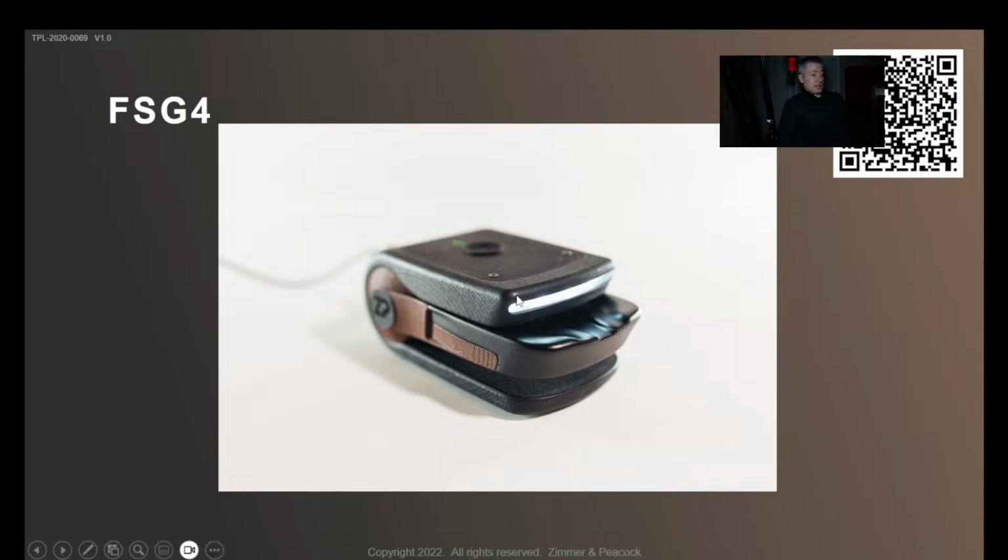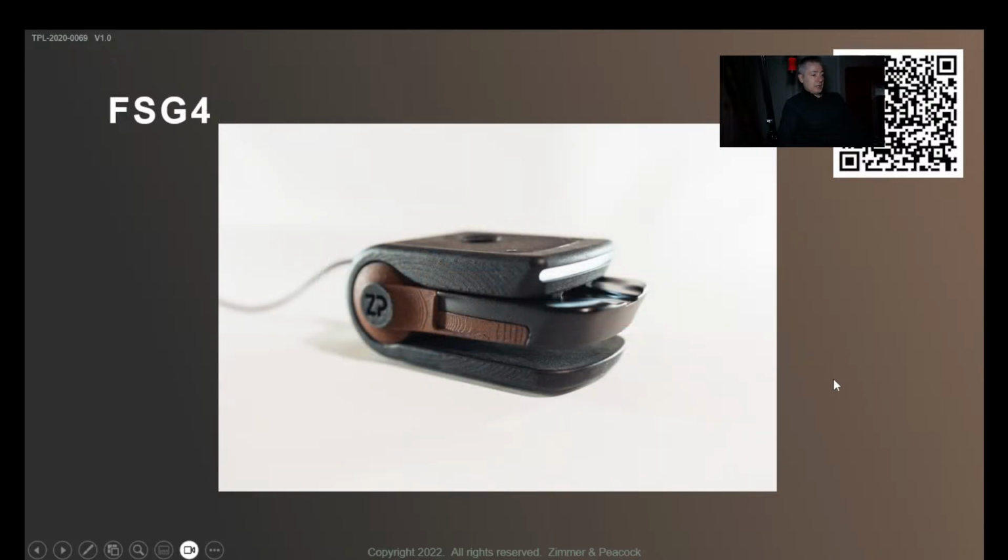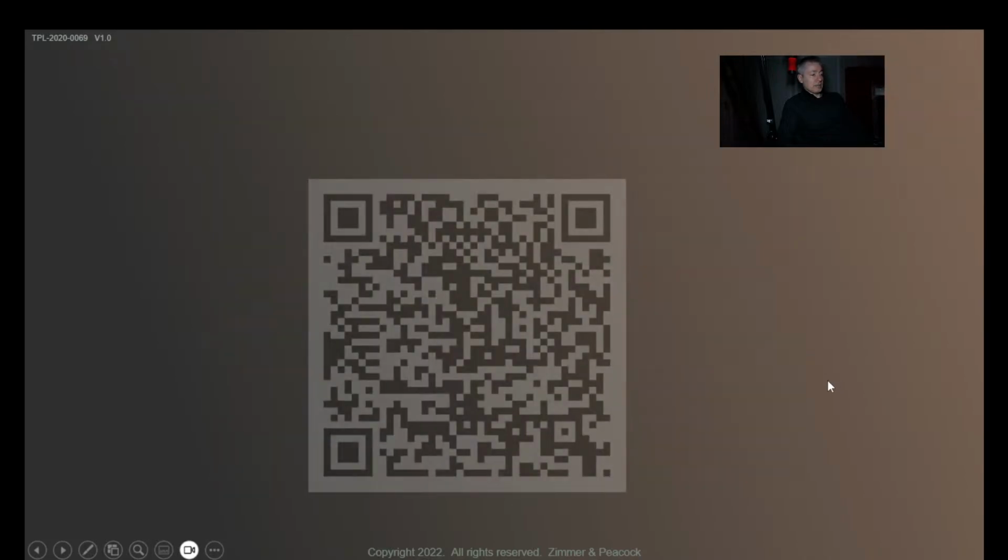So it's got a nice kind of, I wouldn't say traffic light system, but a nice light system as well. And these are just some pictures of that system.